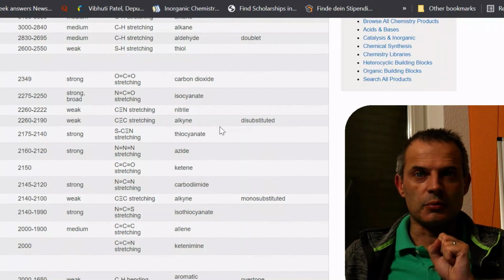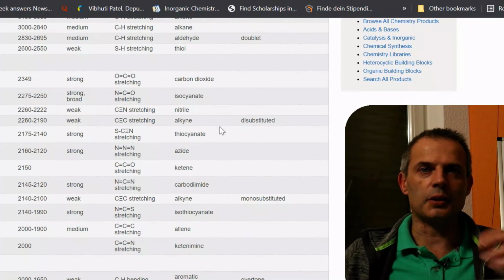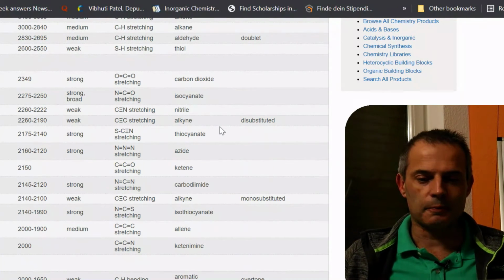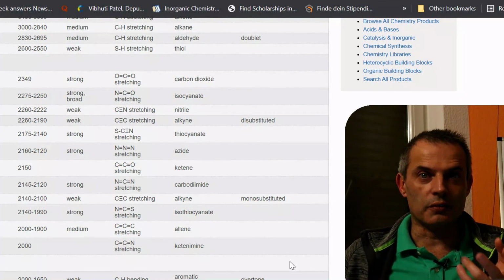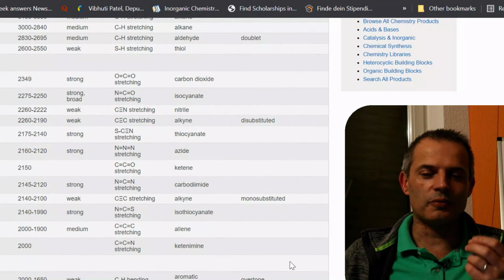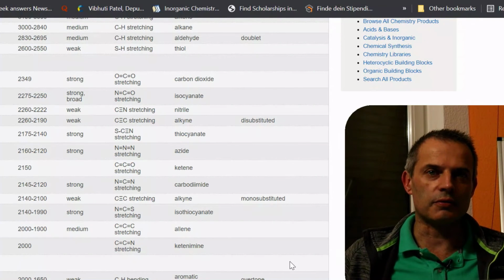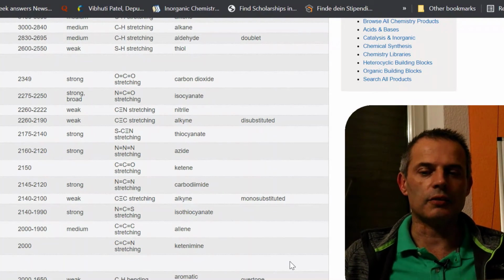In really expensive infrared machines, the whole of the optics is under vacuum, and we don't have that problem either. But yeah, we have to pay money for that. And obviously, one of the main important features of infrared spectroscopy is that it's comparatively cheap, and as soon as you have a vacuum, then you're throwing that advantage away.